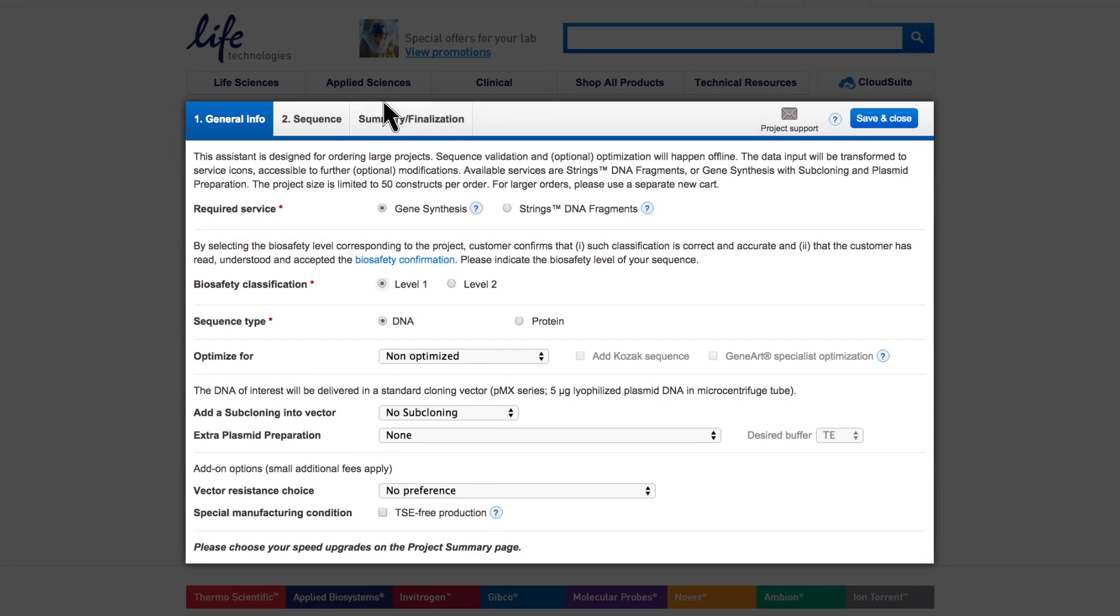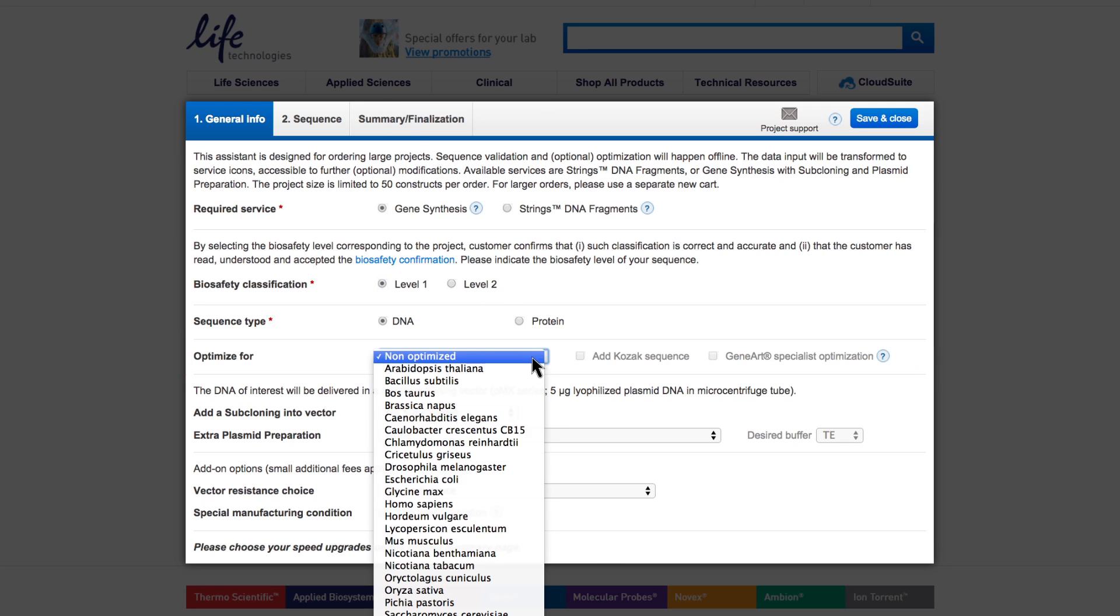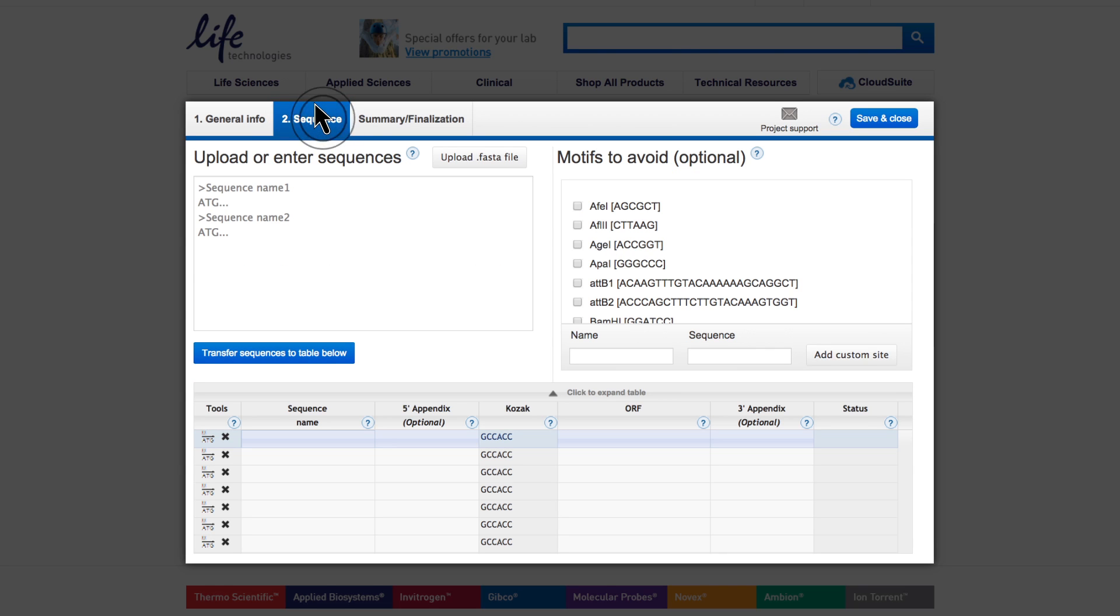If you want to optimize your gene or string's DNA fragment for expression, first select the appropriate expression host for sequence optimization on the General Info tab. Select Add a Kozak sequence when the selection is available depending on the host organism. Click on the Sequence tab. When you add your sequences, upload the prepared coding sequence only.